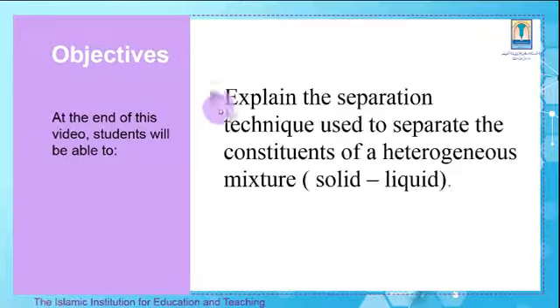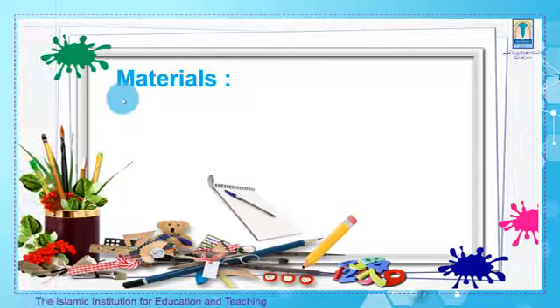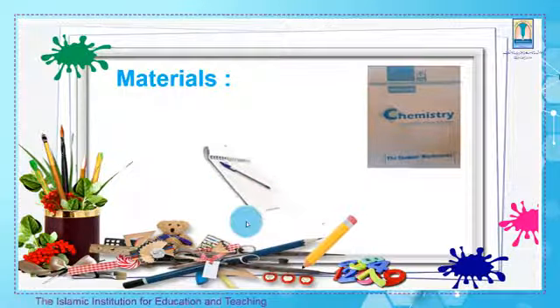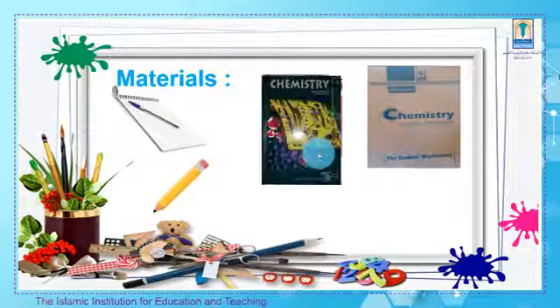Objectives. At the end of this video, students will be able to explain the separation technique used to separate the constituents of a heterogeneous mixture with solid-liquid constituents, filtration. Materials. You need the chemistry worksheet, a notebook, a pencil, and the chemistry book.